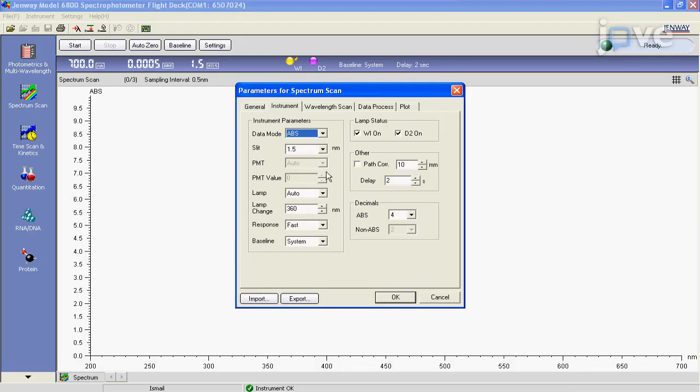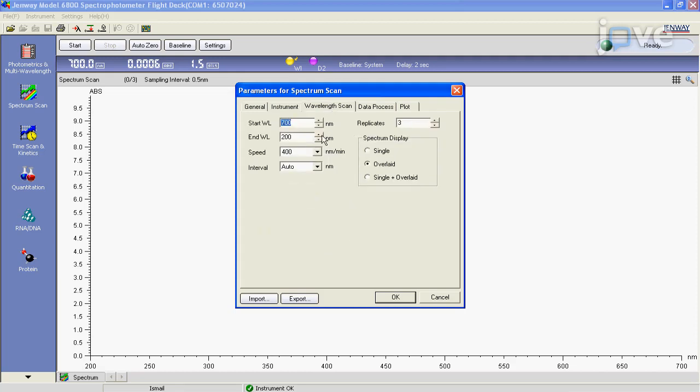Go to the instrument tab and select ABS for data mode and slit width of 1.5. Go to the wavelength scan tab and set a start wavelength of 680 nanometers and end wavelength of 380 nanometers and scan speed of 400 nanometers per minute.